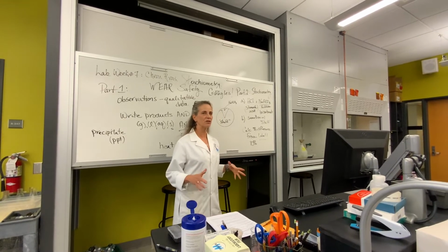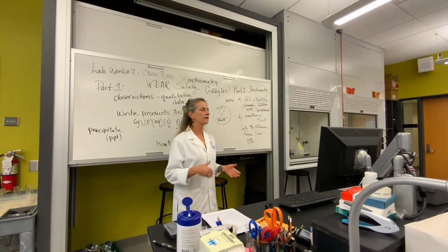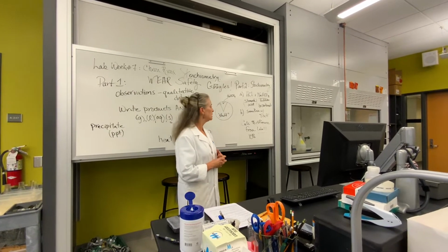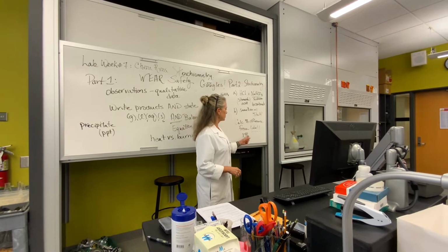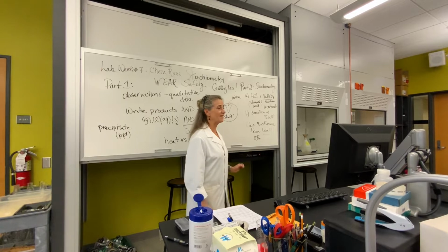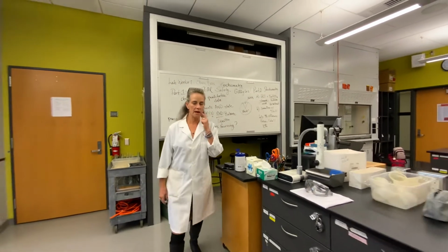It'll be all shady and cloudy because it has the other stuff that doesn't react and is just left over in the Erlenmeyer flask, okay? We are going to calculate the percent difference, but we'll do that tomorrow. So let me go over the specifics of how you're going to do this. So I'm going to come back this way, all right?